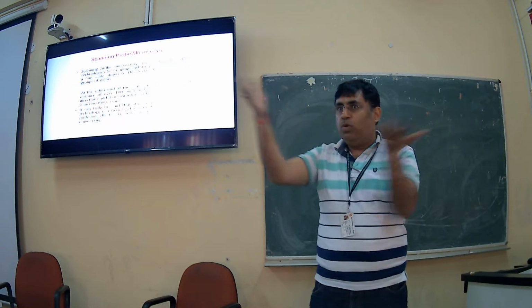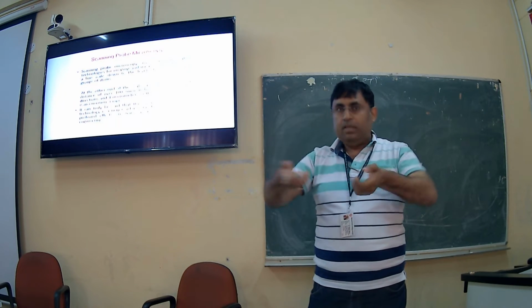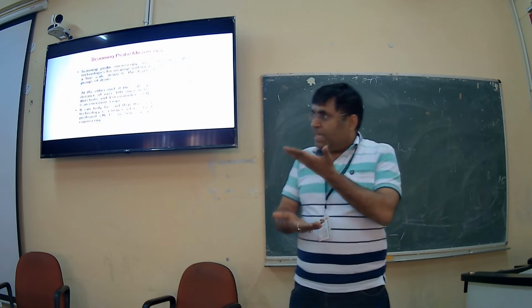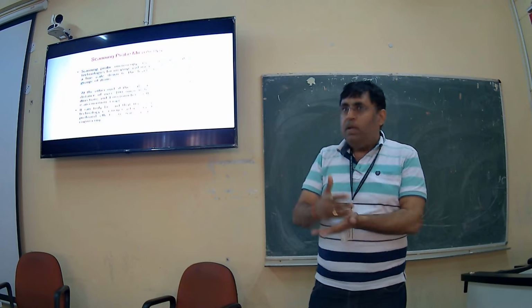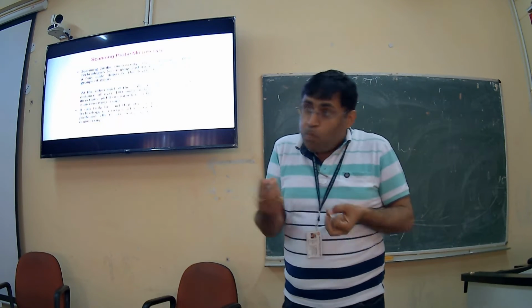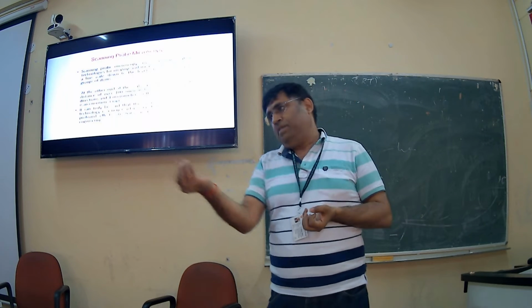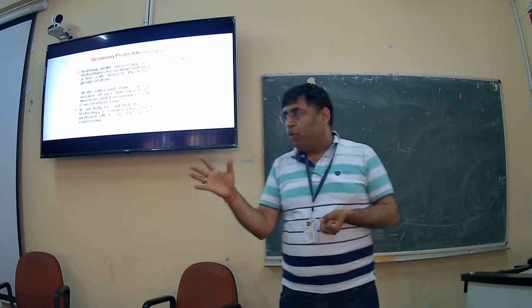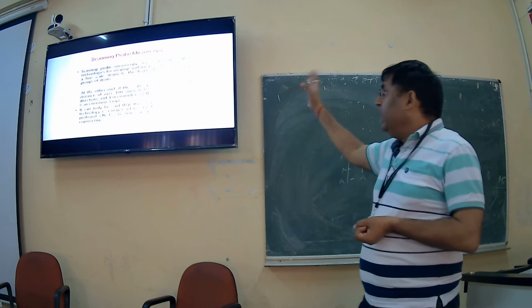Again, scanning, you do scanning every day: you click a photo and you just take the scan. Same way, scanning using some probe, and because it deals with very small particles, it is functionally a microscopy.